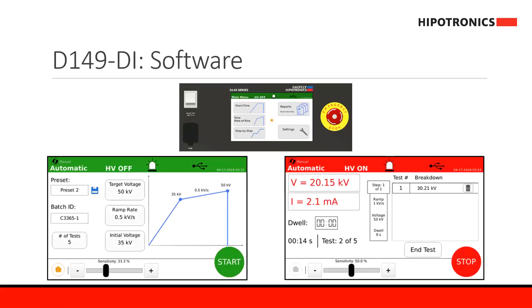Here we can see some of the software windows you would observe on the equipment. On the top is the main menu screen. On the bottom left is the screen where you set the test parameters, either by recalling a certain test or by clicking on each value and changing it to the desired value. Once you press start, the screen will switch to red to indicate that high voltage is on, and values will change as the test progresses. You will see the number of tests and the breakdown voltage on the right side, and once the test ends you can export all data via USB.